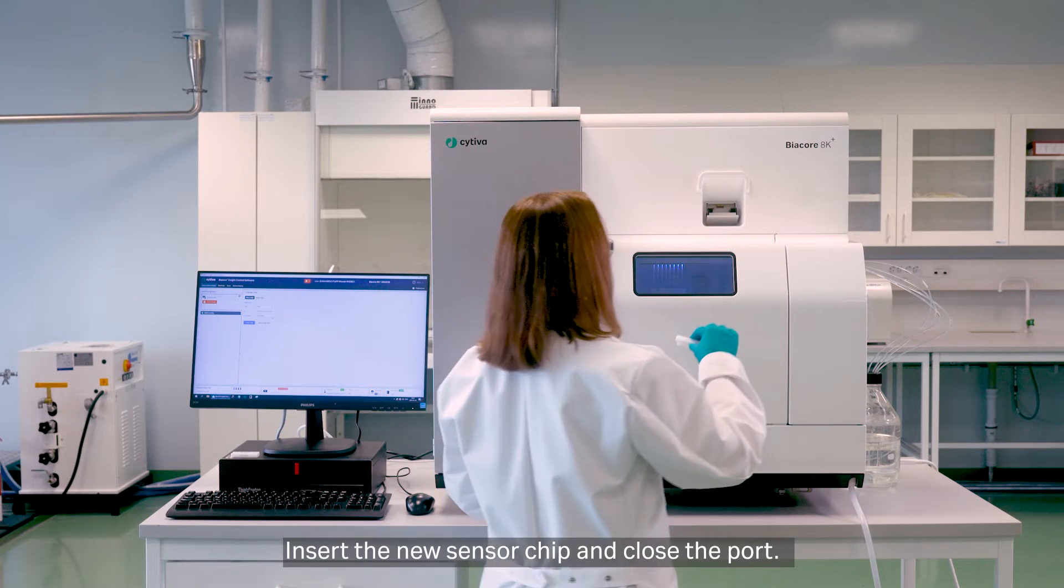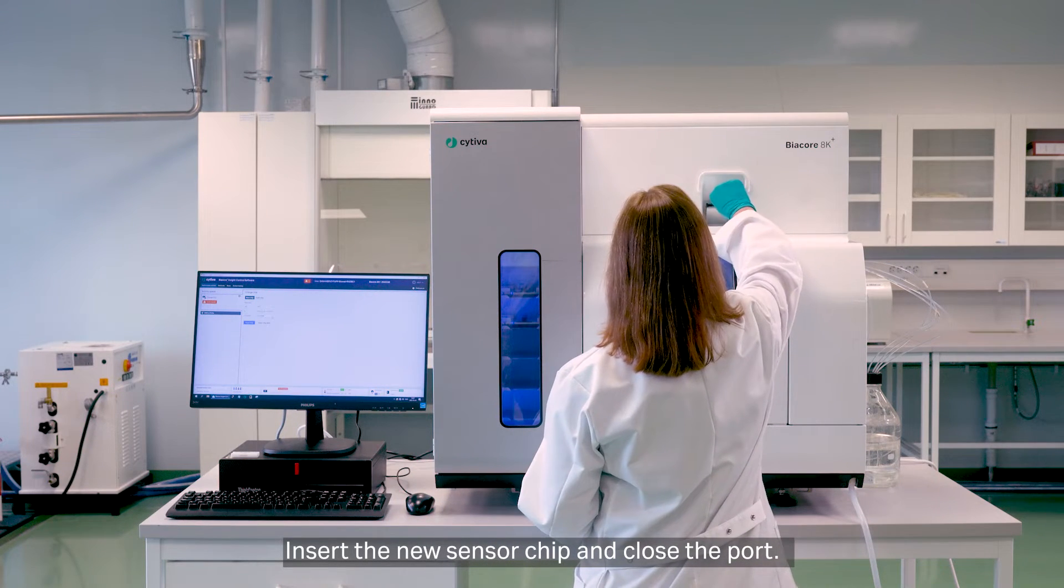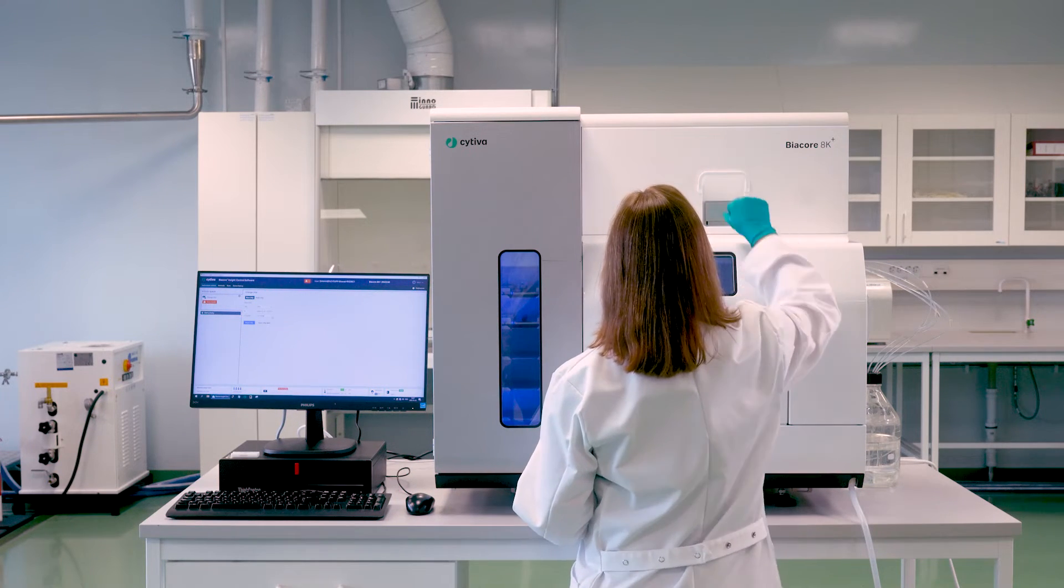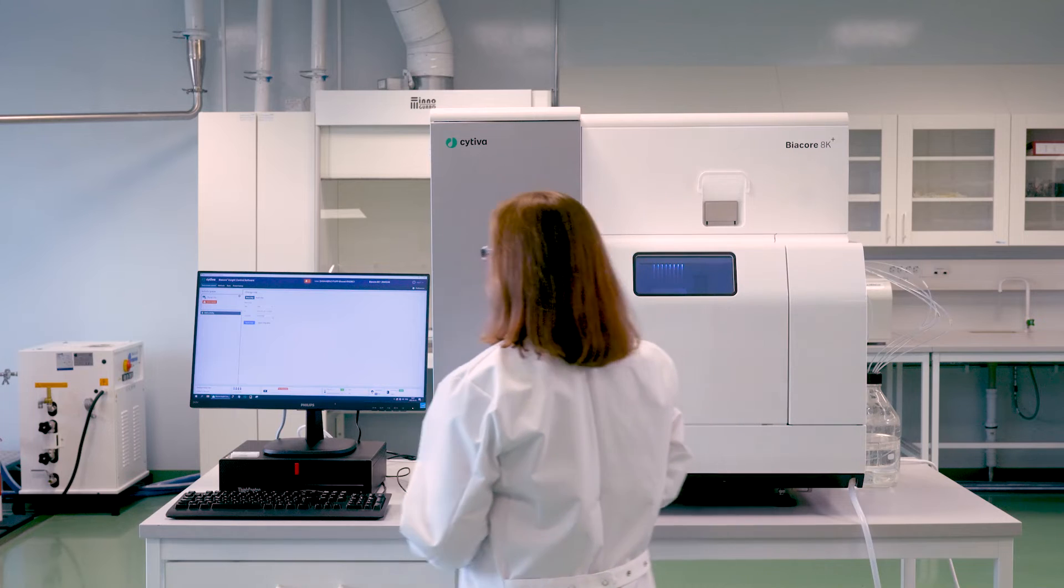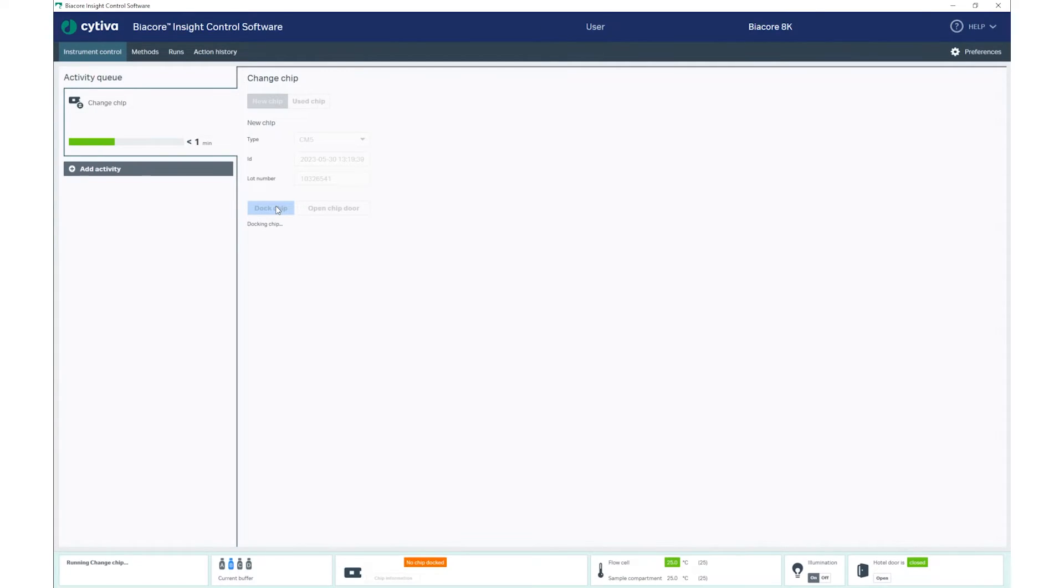Insert the new sensor chip and close the port. Select Dock Chip to complete the docking.